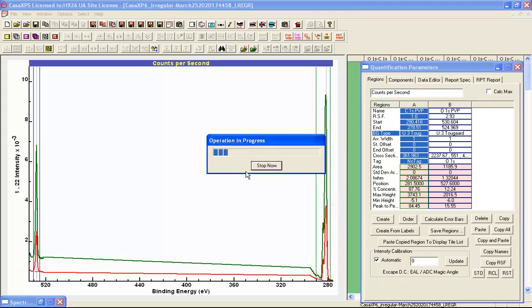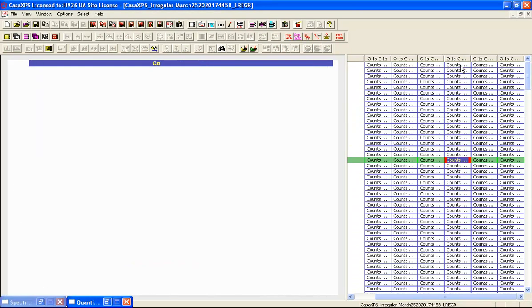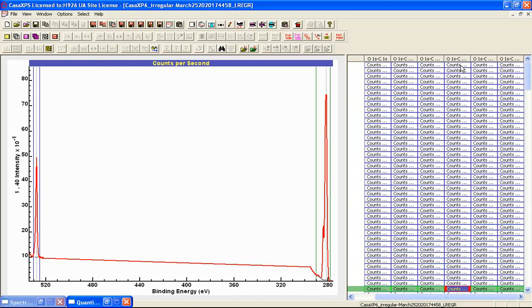The reason that dialog window came up was because there are two columns and they have different element transition fields. You normally would propagate to the same element transition field. I should have a region on each one of these VAMAS blocks that correspond to oxygen and carbon.